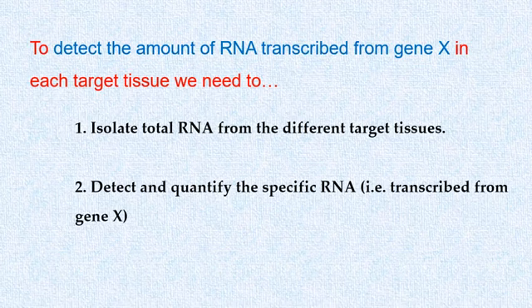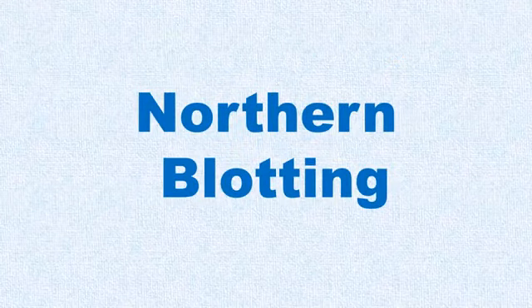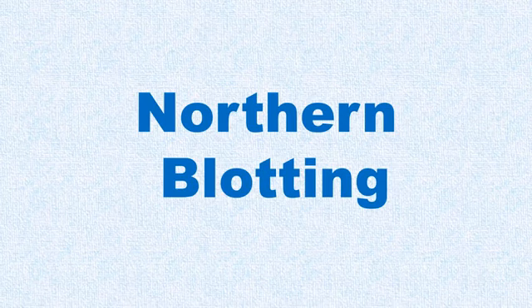The technique which will be suitable for this kind of gene expression analysis is northern blotting. I have already explained the term blotting in the previous video lecture. We also know that when we use the blotting technique for the detection of RNA, it is known as northern blotting. The overall technique and the steps involved in northern blotting are almost similar to what we have studied in southern blotting. There are a few differences that we will discuss today. Let's begin.